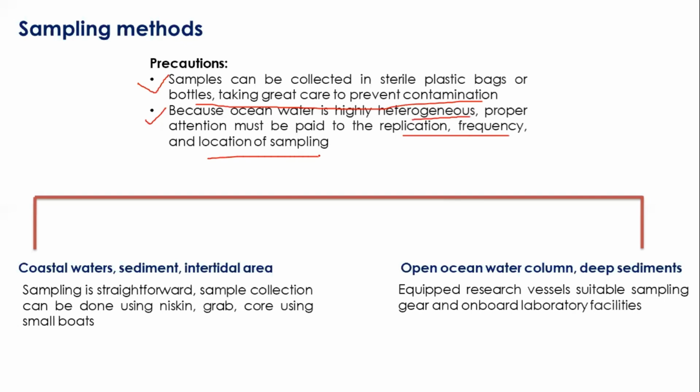For any marine microbiology, there could be two possibilities. One, if you are working in coastal water, sediments, or the intertidal area, which is straightforward because you take grabs, cores, or skim in a small boat, or go scuba diving and then collect the sediment or water column you want.